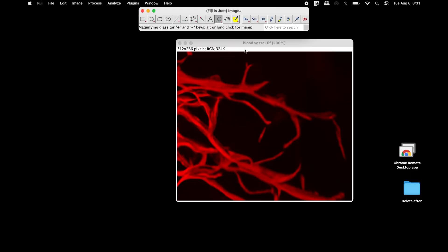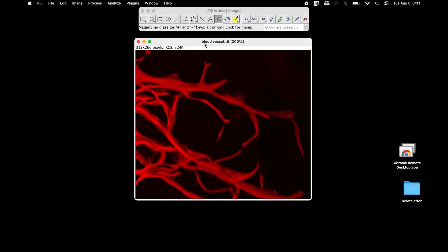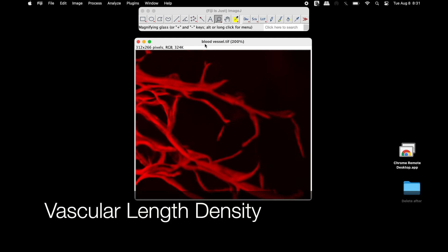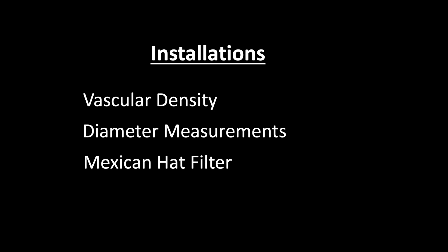Here is an image of blood vessels, and we will measure the vascular density, vascular length density, and average diameter of the blood vessels. To this end, installations of three plugins are required: vascular density, diameter measurements, and Mexican hat filter.